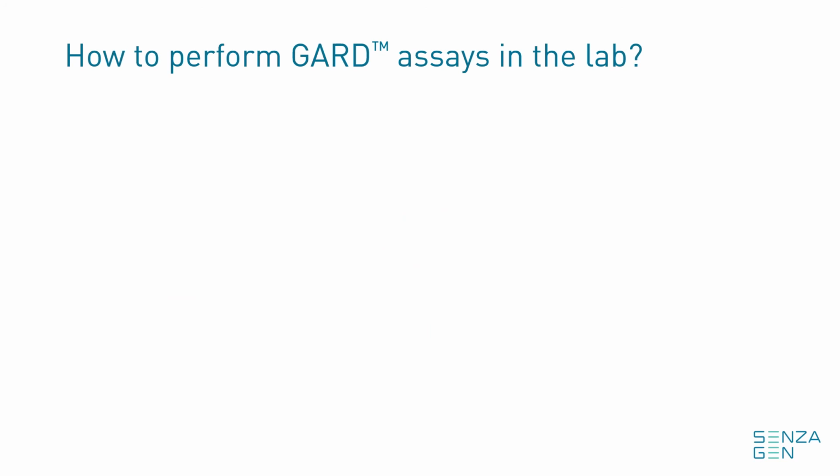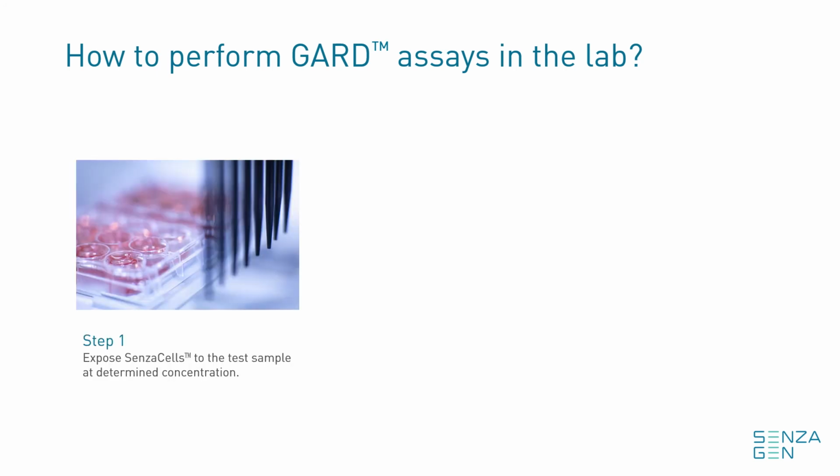Having discussed how the technology is developed and how it works, I also want to describe how the GARD assays are actually performed in the lab using the GARD skin assay as an example. In step 1, the SenzaCells are exposed to the test substance for 24 hours at the highest concentration where 90% of the cells are viable, or at a maximum of 500 micromolar.